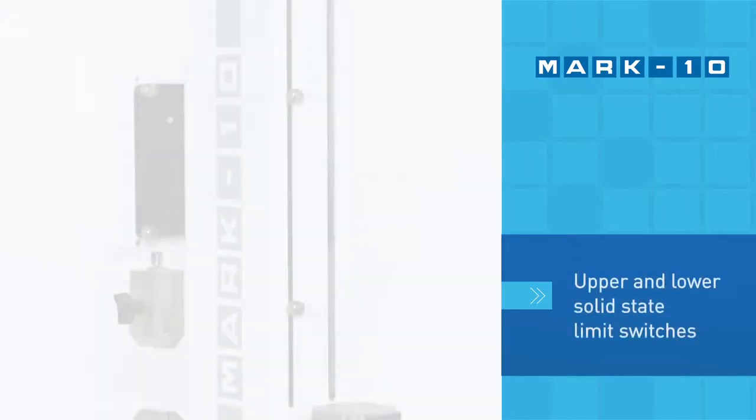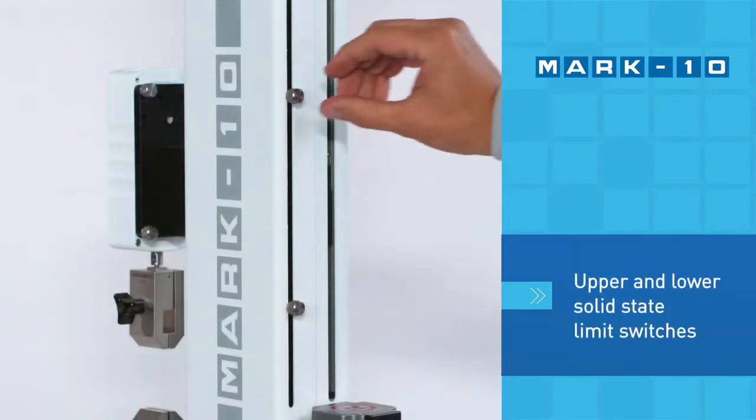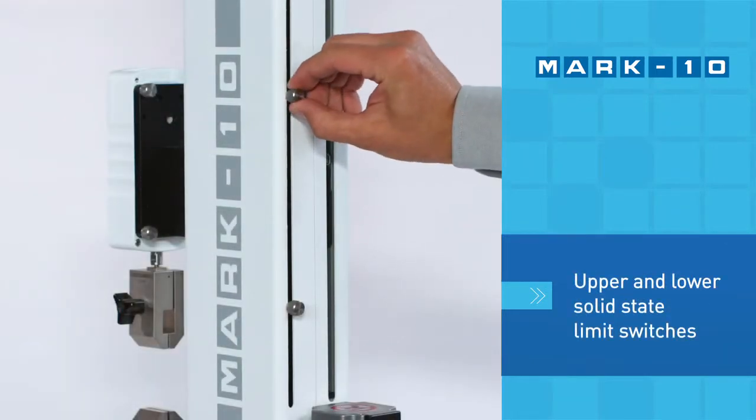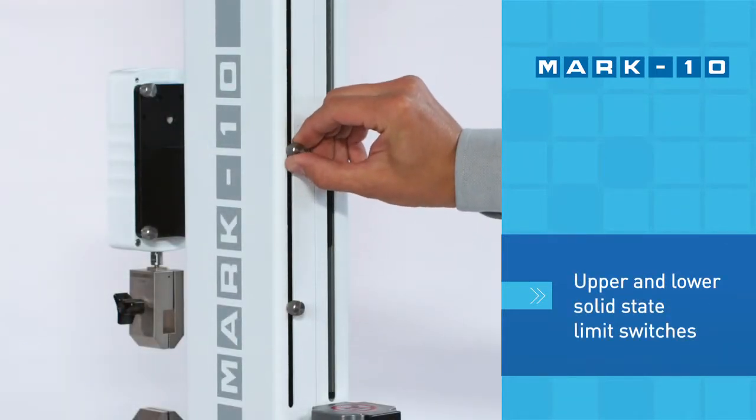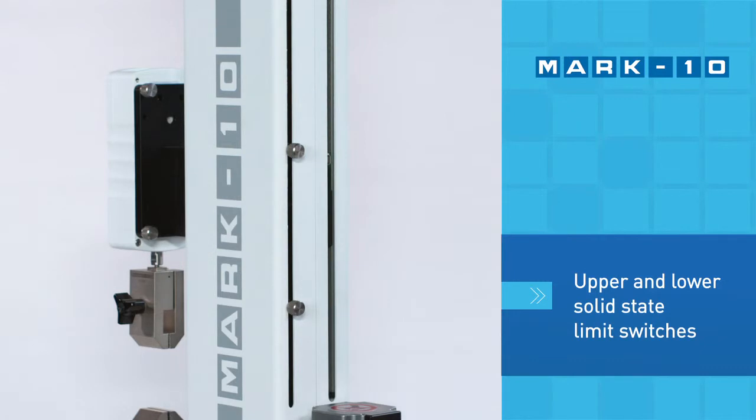Position the upper and lower solid state limit switches to prevent over-travel or as a test end condition.